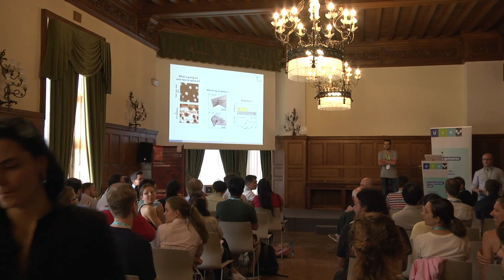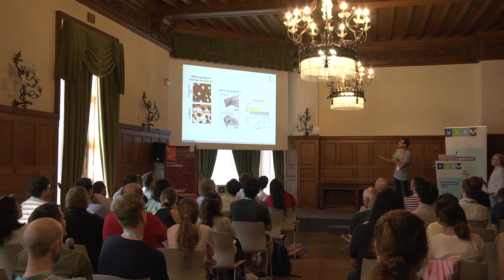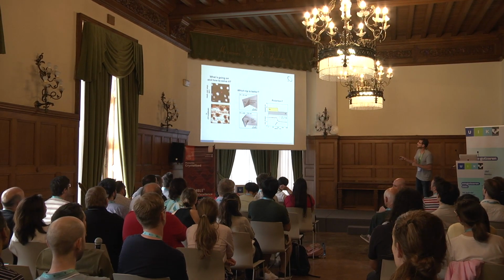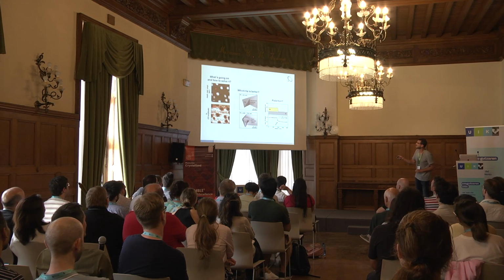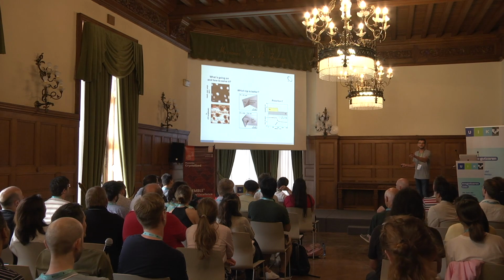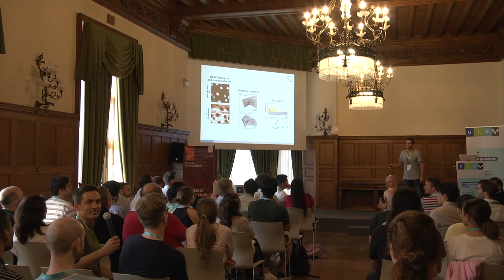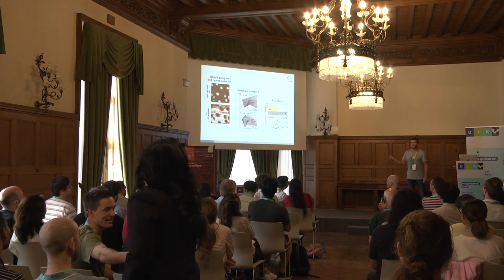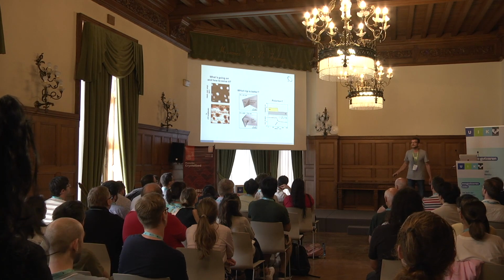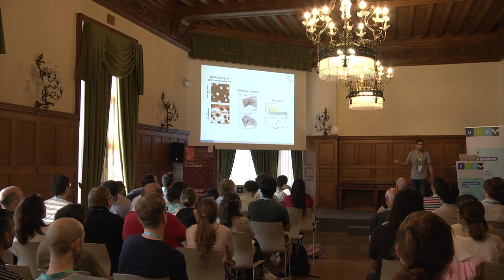Just a question. You mentioned it's topography, but it's written M1 amplitude. Sorry, this is incorrect. This is a topography image. Okay. If you have a closer look, you actually see this kind of strange, noisy features in there too. But here in the optical signal, you see them better. So there was somebody who knew about it. No, it's silicon. I think it's silicon, and it's maybe a sticky sample. Yeah. So okay, but why is a sticky sample producing that crazy stuff there?